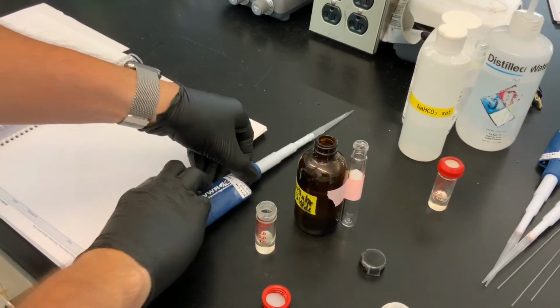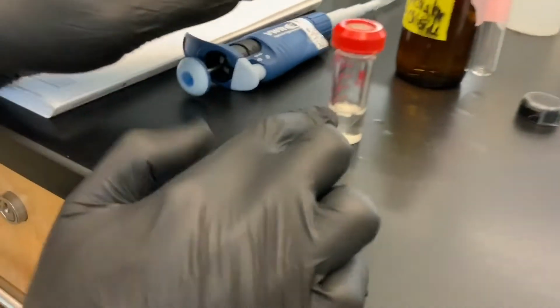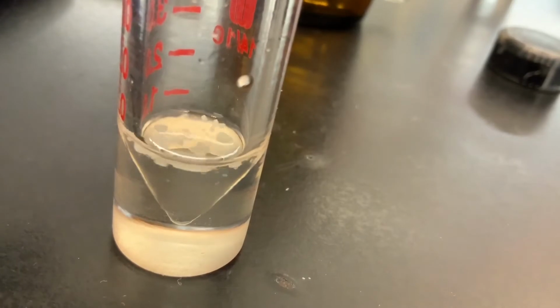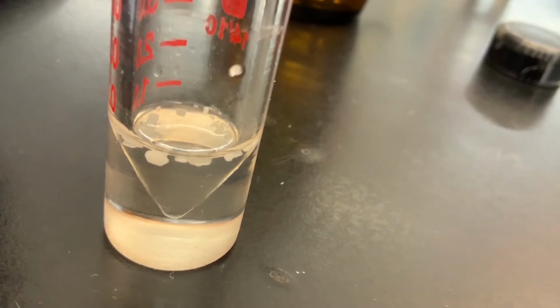Okay, and so what we can note here is that if we look into the reaction vial, we can see that the pieces of benzoic acid are not immediately soluble. And if I shake it and stir it, I can see that it's still taking some time to undergo dissolution, and then for it to be completely dissolved in the methylene chloride. So I need to give this a little stir, and I have to be patient until the pieces break apart and then finally go in.